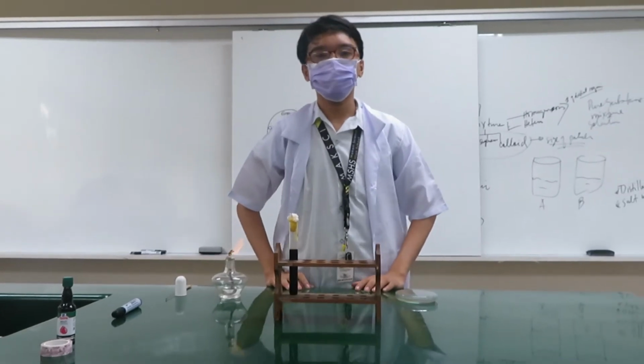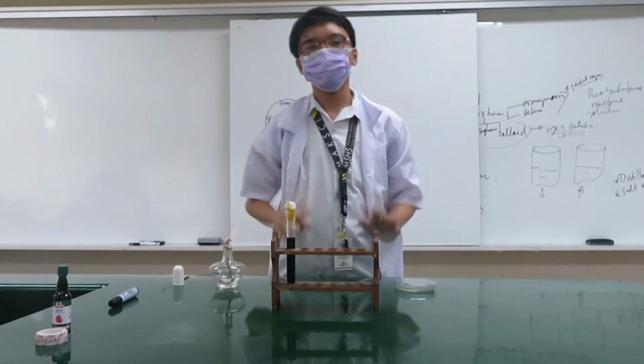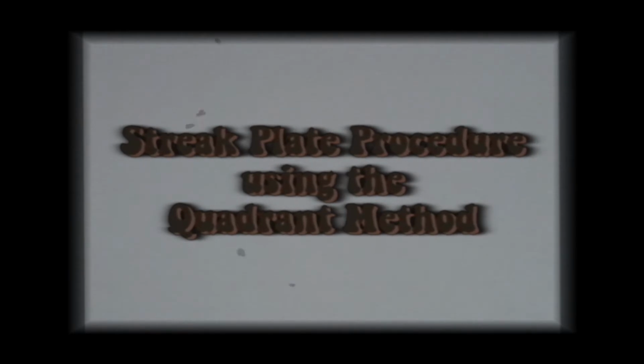7. Be certain that your hands are properly washed with antiseptic soap and warm water. That is all for the aseptic techniques. Let us now proceed to the streak plate procedure using the quadrant method.